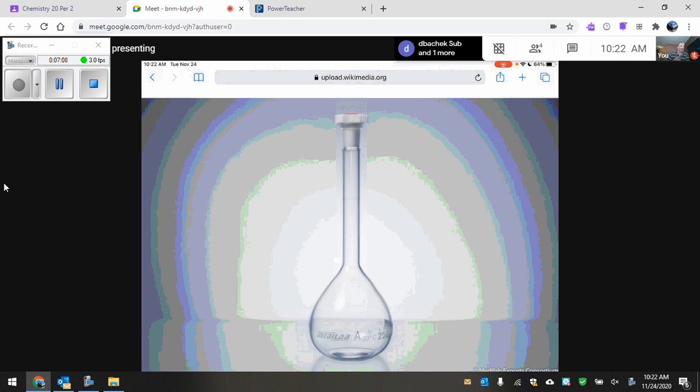That line tells you it's 250 milliliters. This is the only line on here. That's the only job of this flask. If you want to do 100 or 125, this is useless. This is not an option. It only measures 250. That is it, okay?